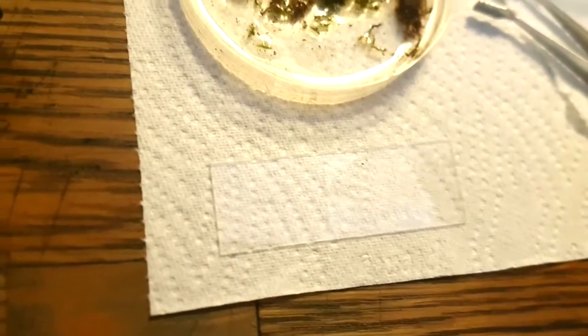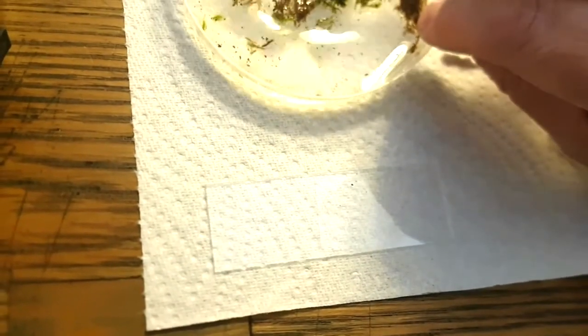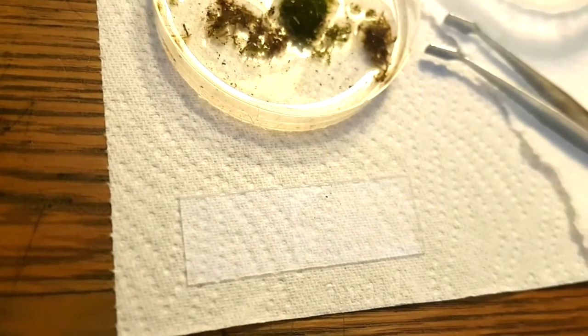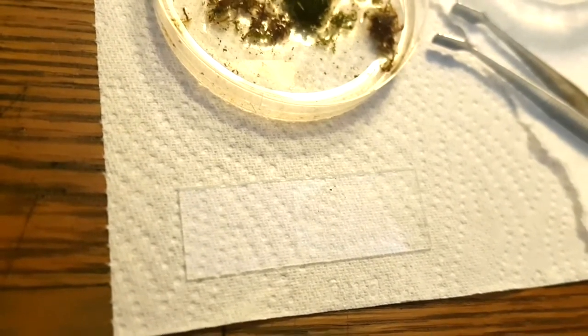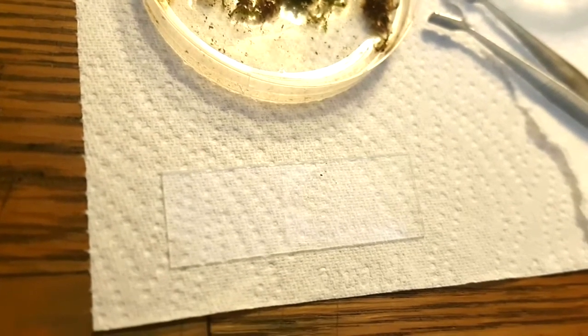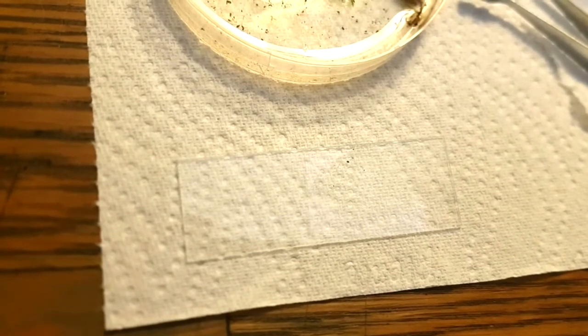Now, I'm going to need to do that over and over again for all of the liquid that's in here. So, as I said yesterday, if you use a lot of water, this is going to take you a really, really long time. So I'll tap the moss on first of all, and then I may start just sucking the water up with a pipette and see what we can get. But let's have a look. We might get lucky and catch something interesting.